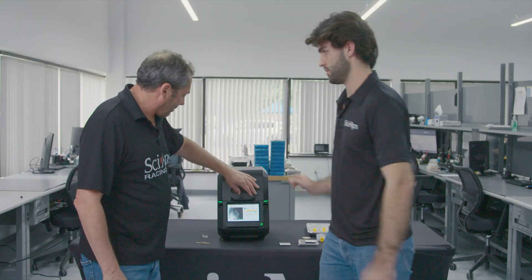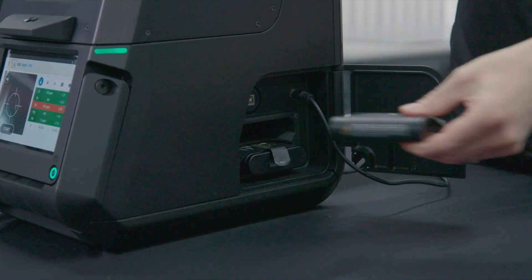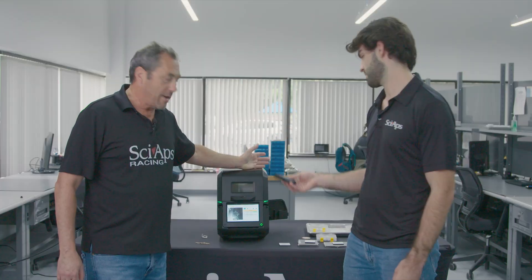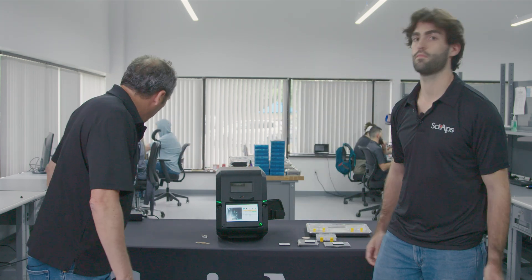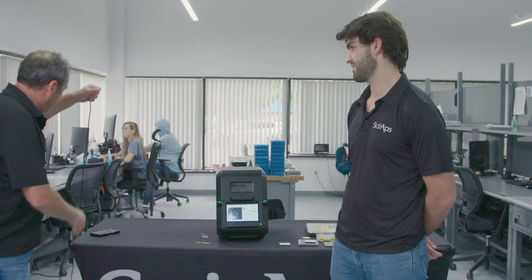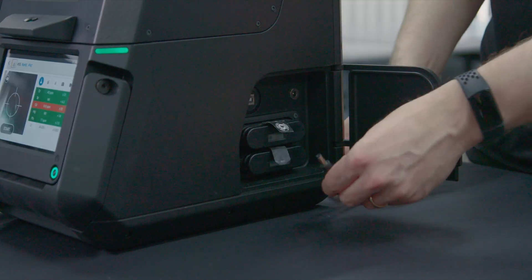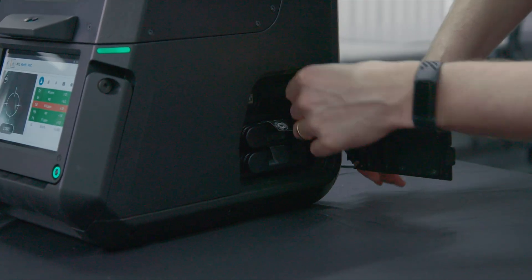Battery-powered, and you've got two batteries back here. They're hot-swappable between them, so when a battery gets low, it switches automatically to the other battery. You can charge one, and you can also run it off of AC power if you're at a desk. When you run it off AC power, it'll power the unit and charge the batteries as well.